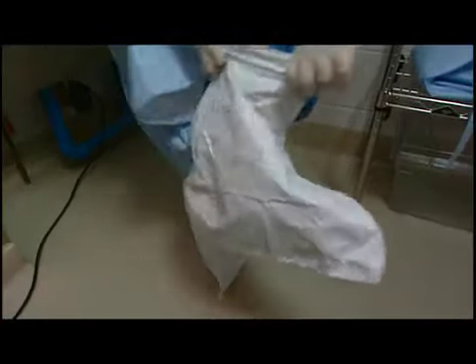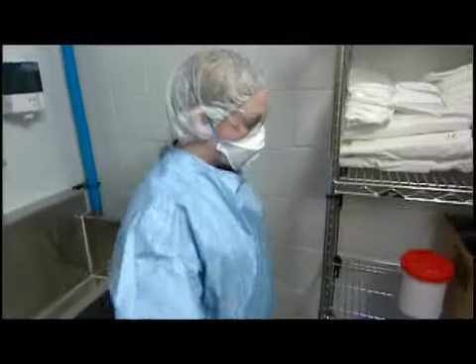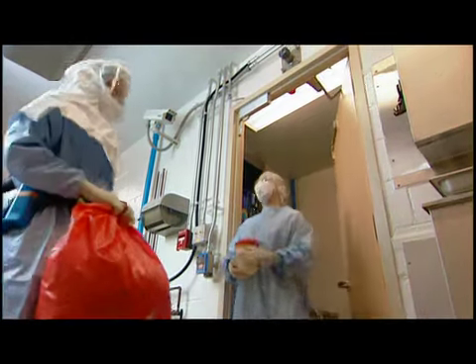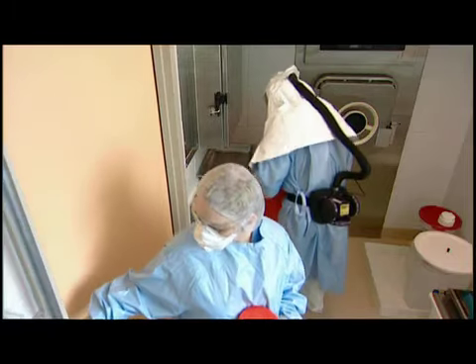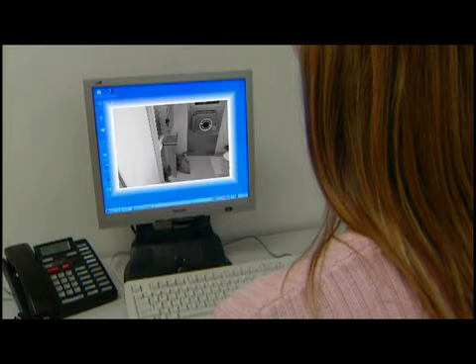You can either keep a pair of shoes for working inside the lab or wear shoe covers. If you have dedicated shoes, remember they are now considered contaminated, so they can't come out. All these protective clothing layers are necessary for your protection. And for increased safety, a buddy system must be implemented. We recommend that at least 2 people should be working in the Containment Level 3 lab at any time. If that is not possible, other means of monitoring or surveillance must be in place.